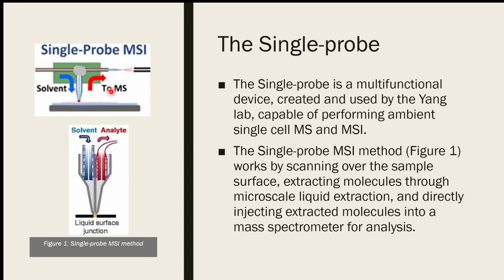We snip the ends of the tip here. It varies. I tried to get around 10 microns, but during the experiments I have to snip it quite a bit of the time, because it can tend to clog, since some of the analytes can be a bit annoying. And then we use UV glue to set these capillary tubes in here.